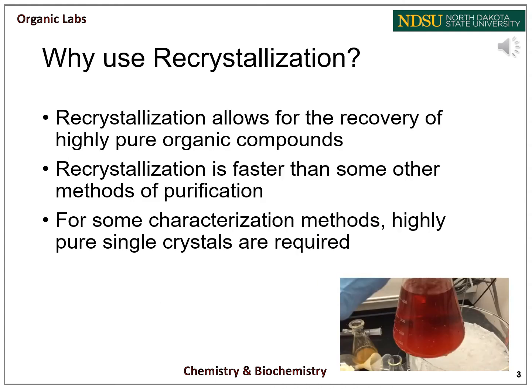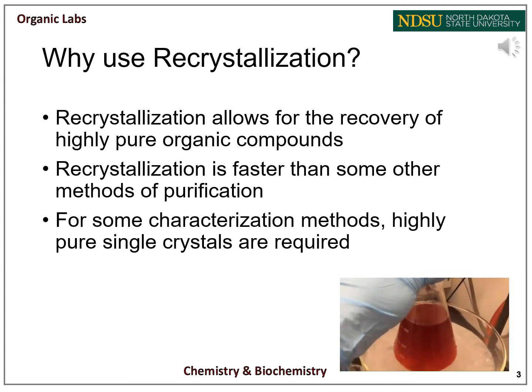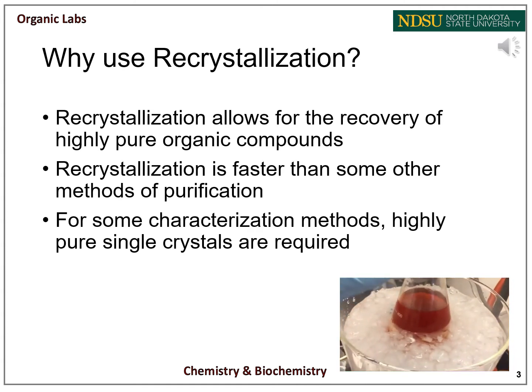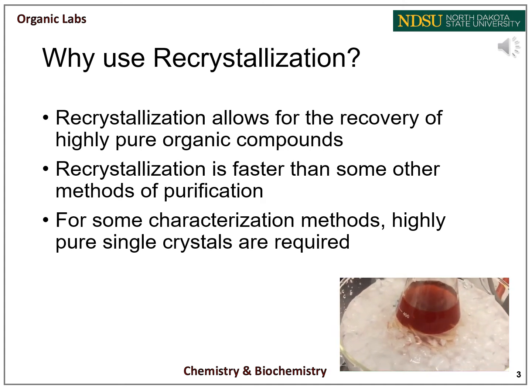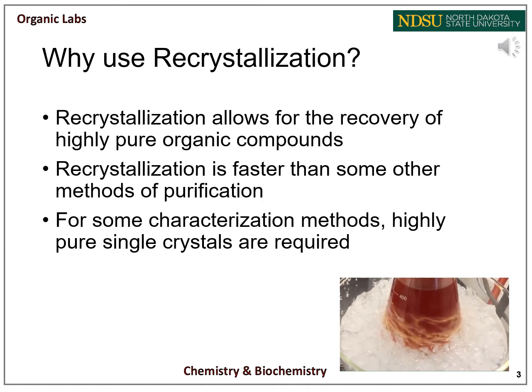So why would a chemist want to use recrystallization over other methods? Compared to some other common methods of purification, recrystallization can be faster, it can be less wasteful, it can be greener, and some characterization methods that chemists use, such as X-ray diffraction, require highly pure single crystals that can only come from complicated recrystallization techniques. Also, it's really just neat to watch.